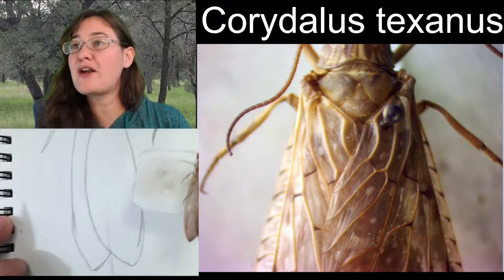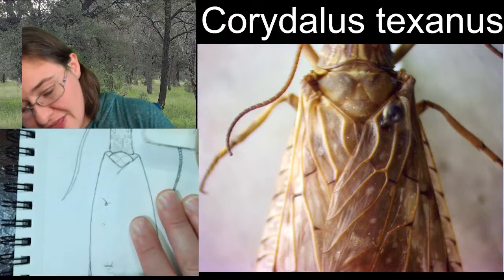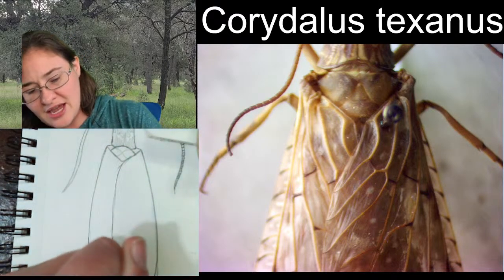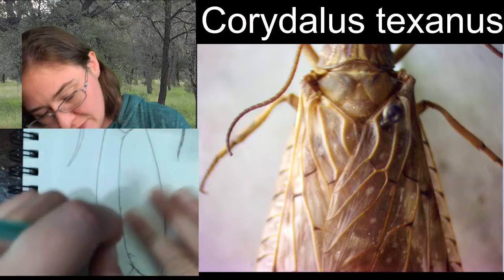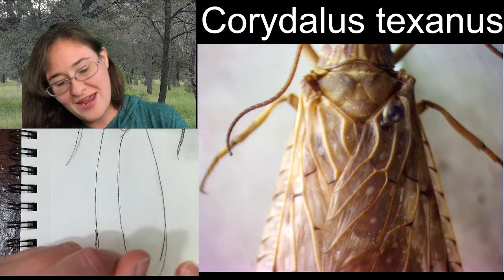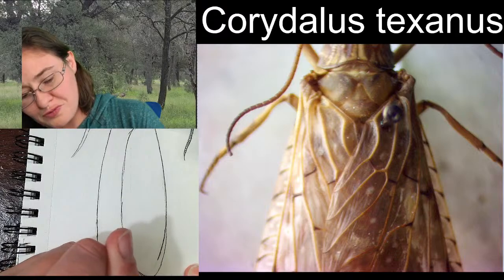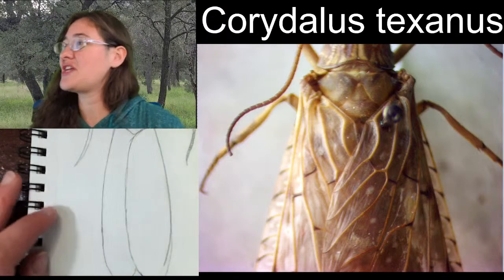I think that's better. I think my next real issue is that this wing just got a little bit too big. It arched too far over the center. I think that the wing stays closer to the center line, more like this. I am pretty happy with that. So we are going to be putting our insect back underneath the microscope. Getting some wingmination taken care of.